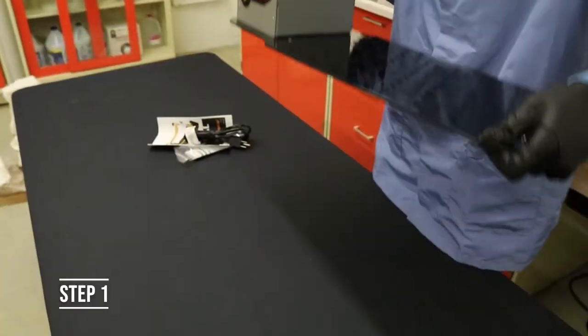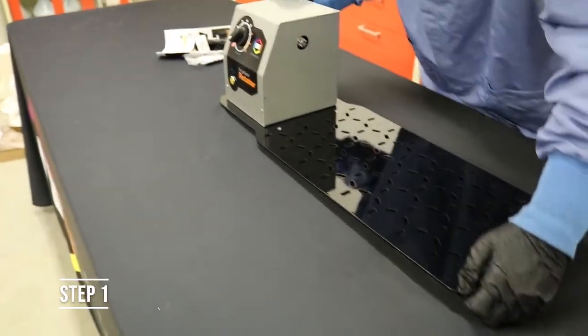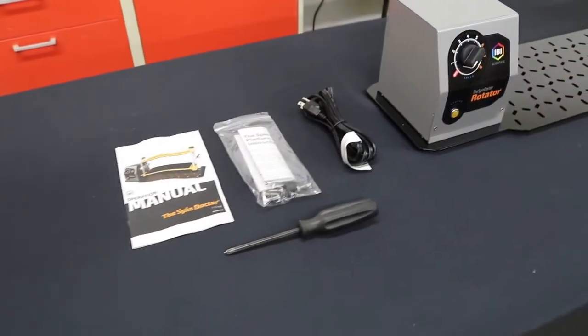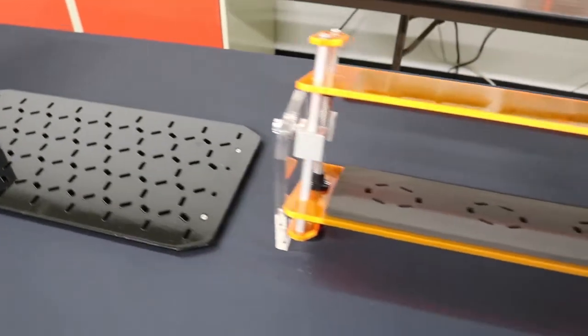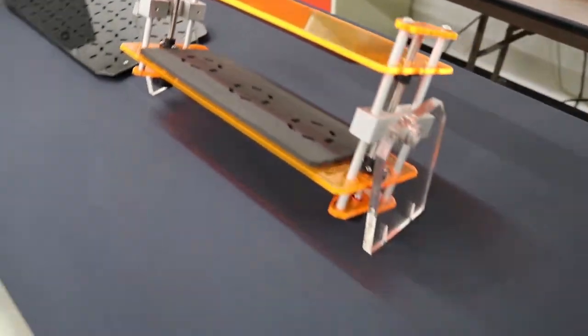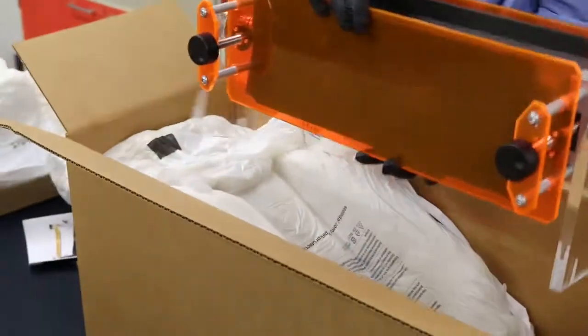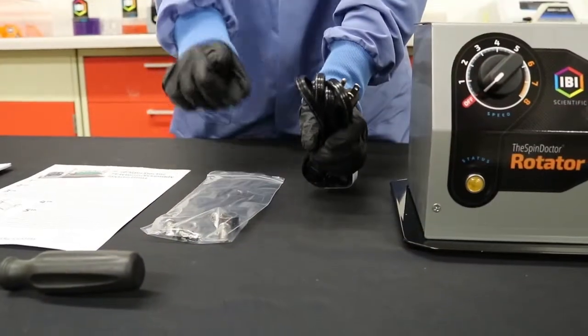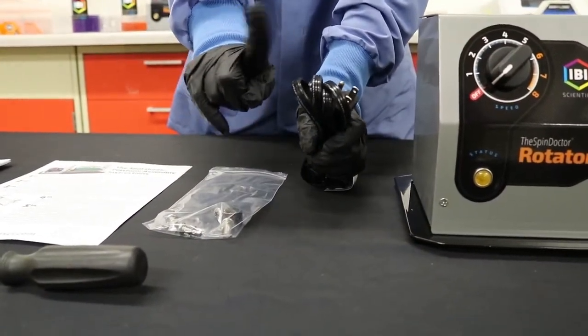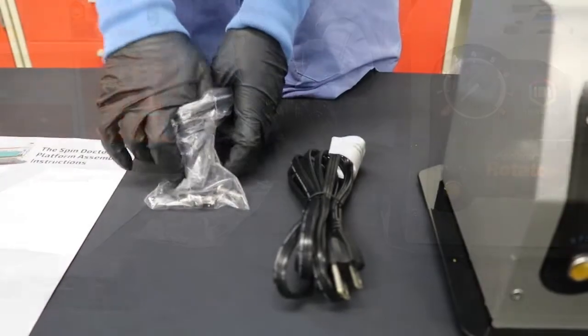Step 1. After carefully unpacking your new Spin Dr. unit, place the base of the unit on the countertop or open space where you can access the base from all sides. Next, carefully unwrap the platform assembly and set the assembly on the countertop. Do not plug in the Spin Dr. until you have completed step 5.